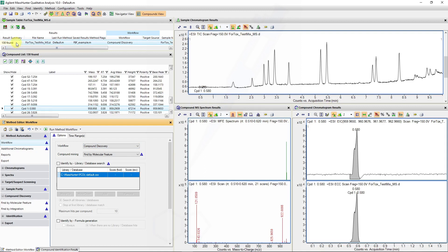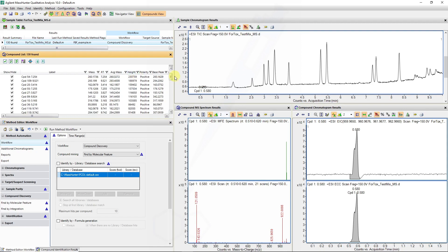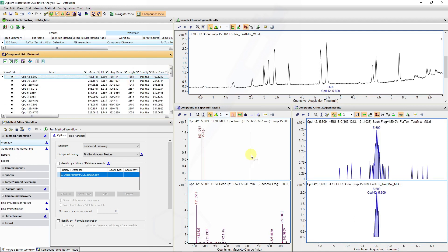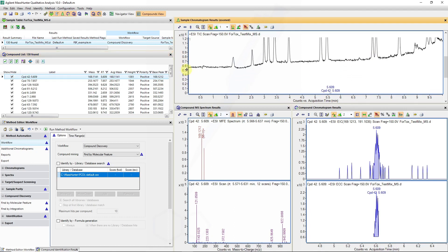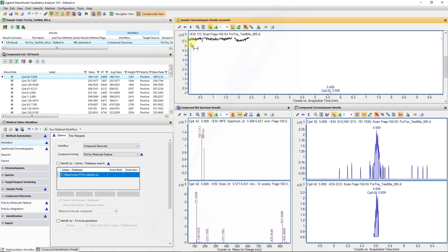We can see 130 different molecular features were found, and we will sort these by height and gauge whether these are high-intensity enough features to deal with. I'm right-clicking and dragging on the axes to see where some of these very low-intensity features occur.